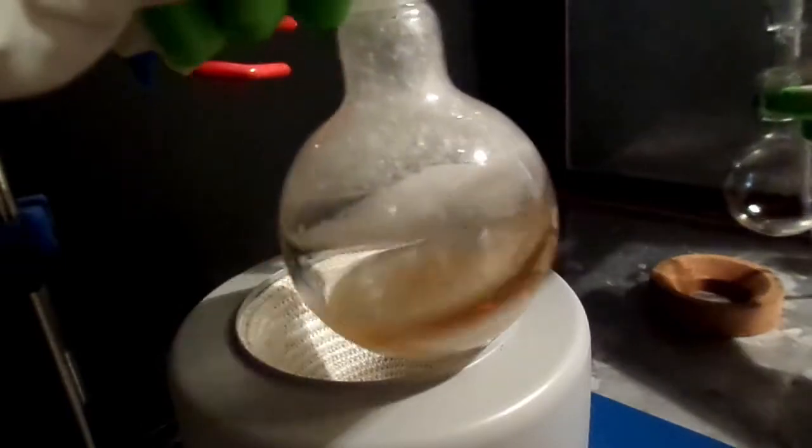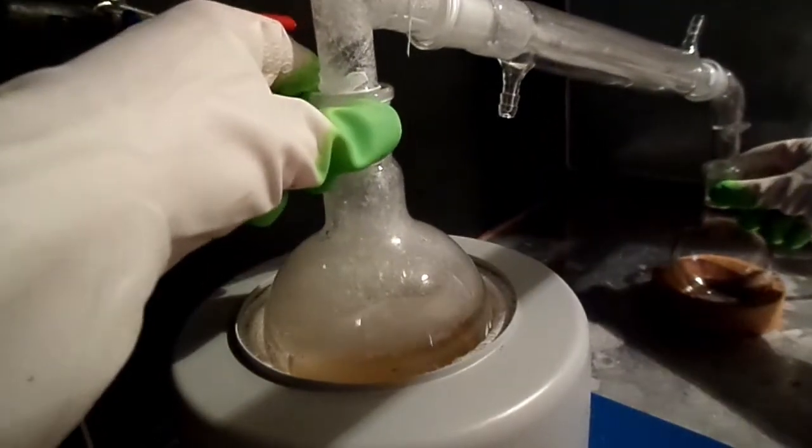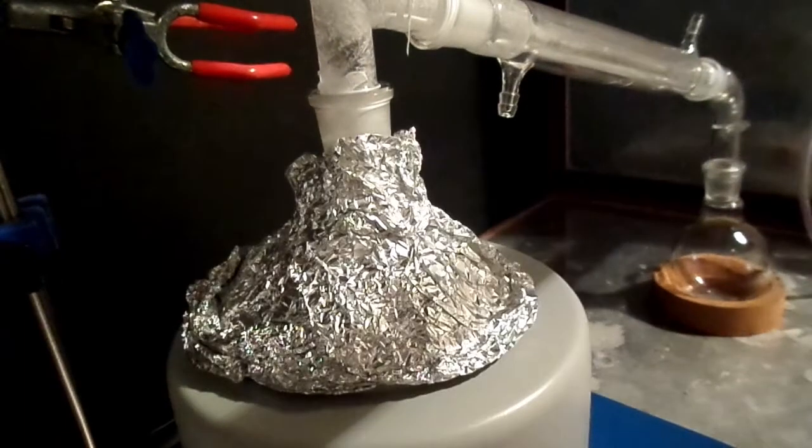The reaction mixture temperature is slowly raised to 200 degrees over the course of an hour and a half and held at 200 degrees for a total of two and a half hours. Due to the high temperatures, I covered the flask with some aluminium foil to help minimise heat losses as well as hopefully melt any benzamide off the walls of the flask and back into the mixture.